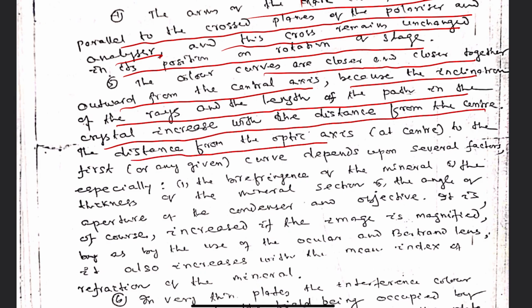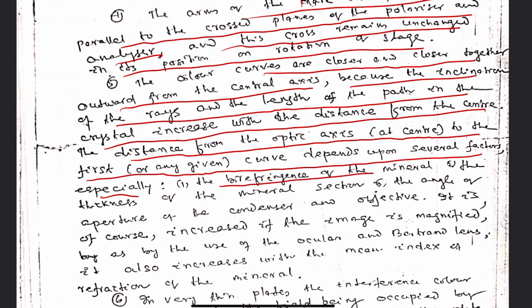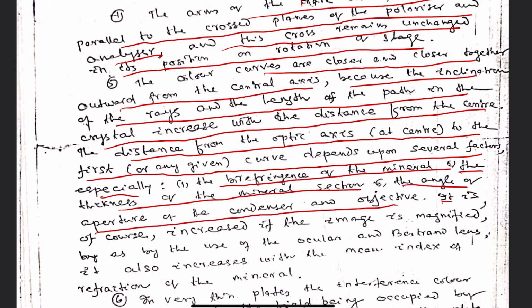The distance from the optic axis, that is at the center, to the first or any given curve depends upon several factors, especially the birefringence of the mineral, the thickness of the mineral section, the angle of the aperture of the condenser and the objective.